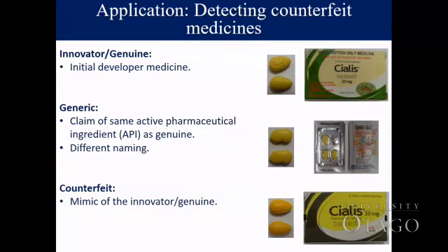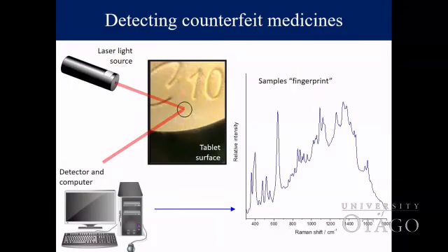We also have some generics, which have the same active ingredient and should have the same effects. And we have counterfeits, which are pretending to be the real thing, but may not work in the way expected. We took a series of our samples and shone laser light at them, and we basically get a lovely fingerprint for each tablet.